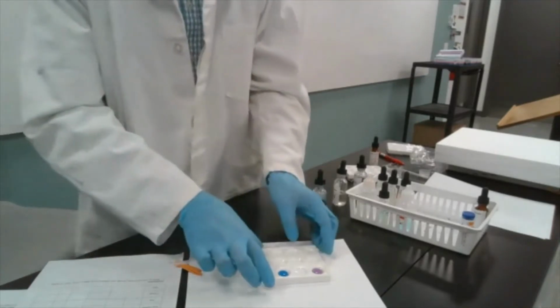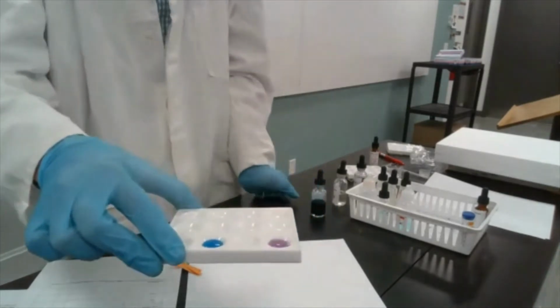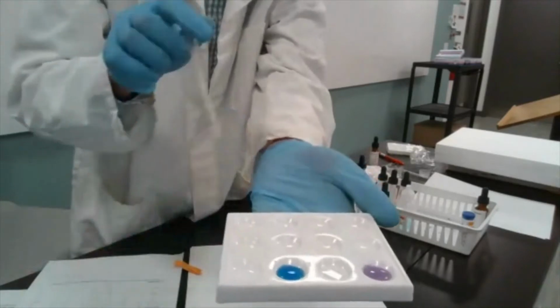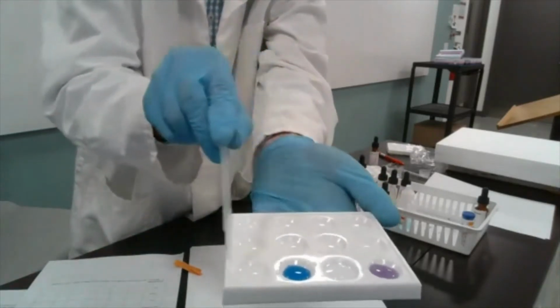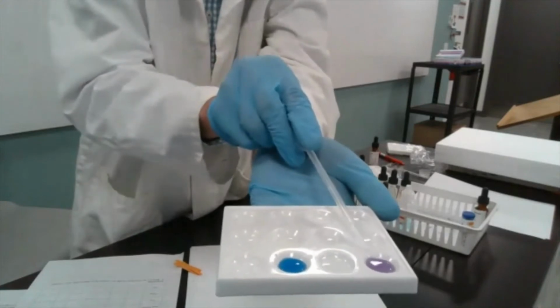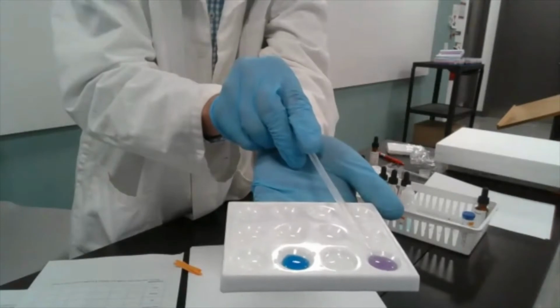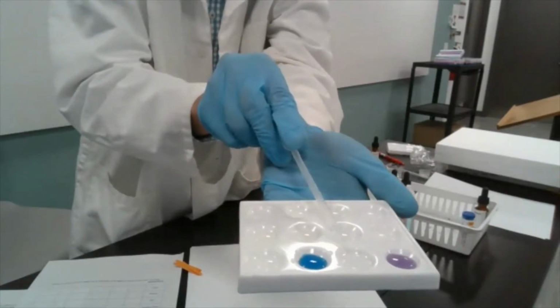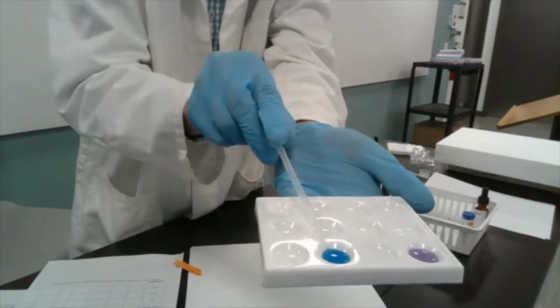For your observation, just record the color. Don't try to make any conclusion just yet. So you see that here you have, so this is our water, right? And we have blue litmus, and the color is, you can write it down as blue, or purplish blue, whatever. Phenolphthalein colorless, and bromothymol blue is blue.